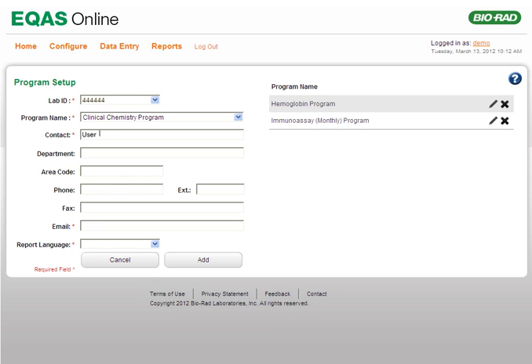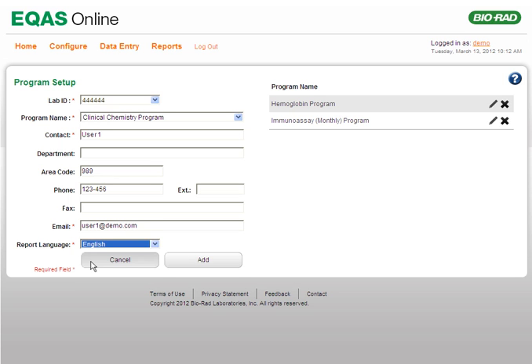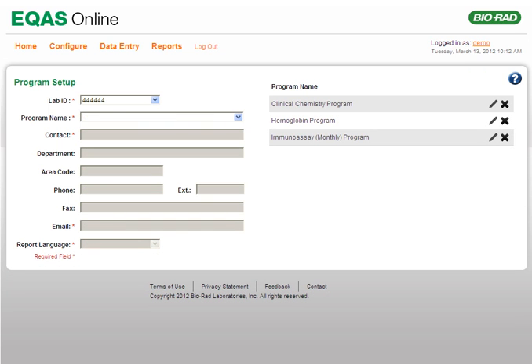Enter the name of the contact person for this program in the Contact field. Enter other details such as department, area code, phone number with extension, fax number, and the email address of the contact person in the appropriate fields. You can specify the language in which you want the reports to be created by using the Report Language list. Finally, click Add to add the eQAS program.